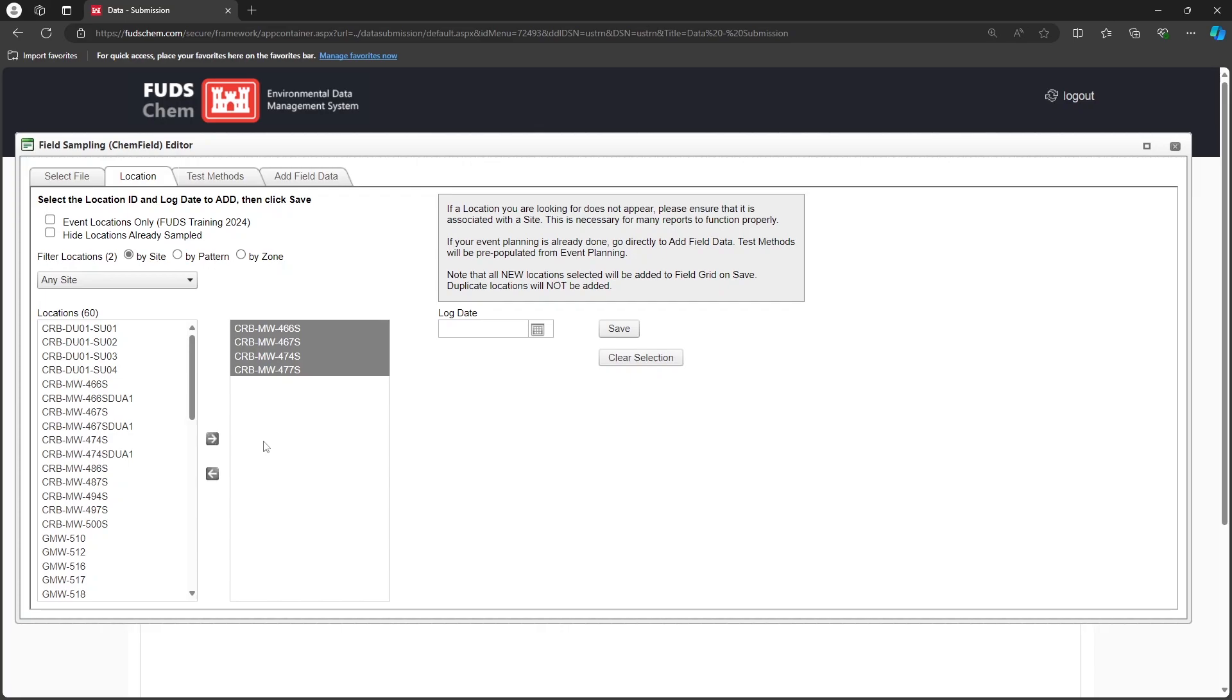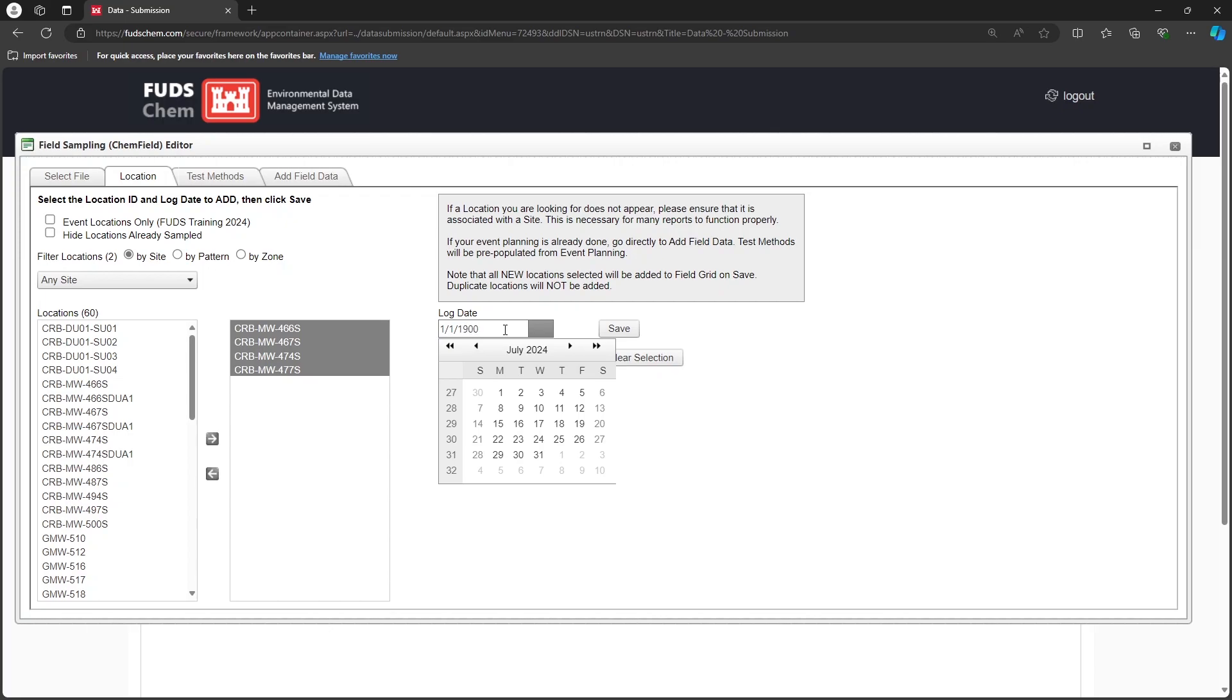Next, enter the sampling date. If you want this field to be blank on the CoC so the samplers can fill it out by hand, set the date to January 1, 1900. Click Save.